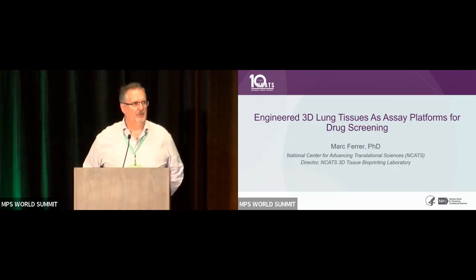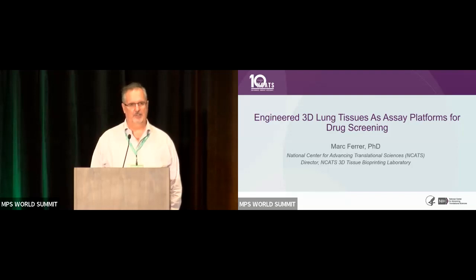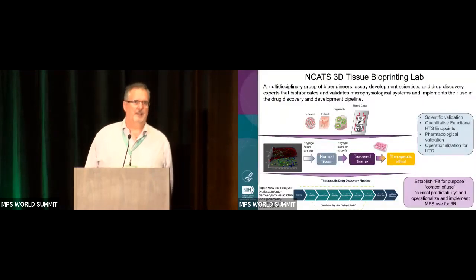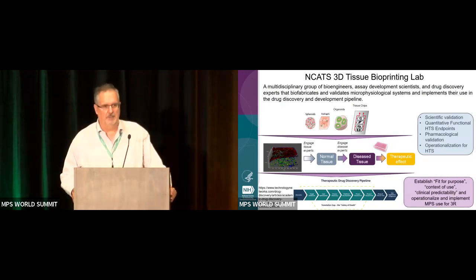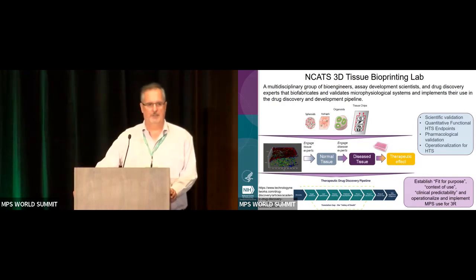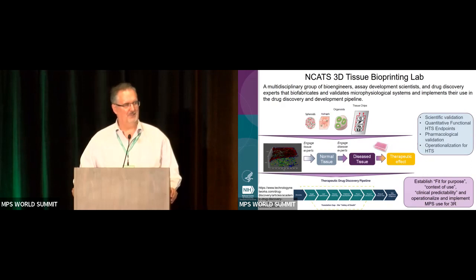Today, I'll be giving you a little bit of an overview of the program that we have set up at NCATS using engineered 3D lung tissues as assay platforms for drug discovery. Just to give you context, about 4 years ago at NCATS, we established the NCATS 3D Tissue Bioprinting Lab as a multidisciplinary group of bioengineers, assay development scientists, and drug discovery experts to biofabricate and validate microphysiological systems and implement their use in the drug discovery and development pipeline. It does take a village to develop, validate, and use these tissues for drug discovery.